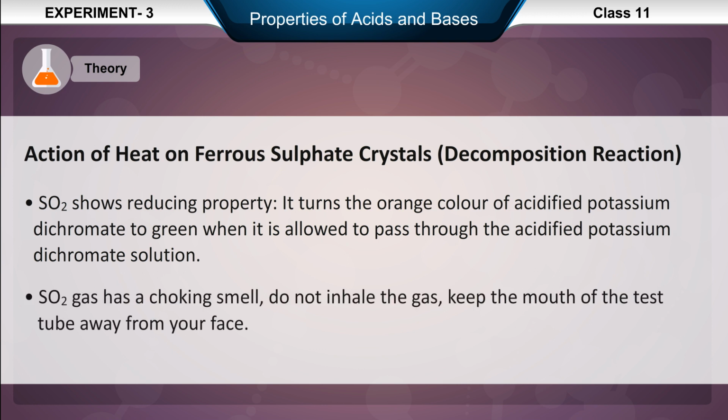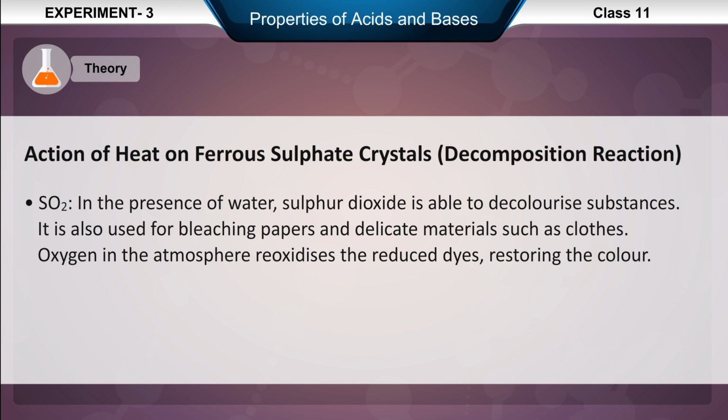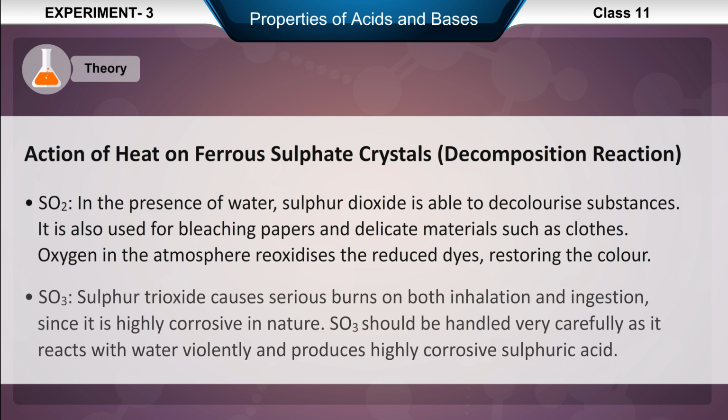SO2 gas has a choking smell. Do not inhale the gas. Keep the mouth of the test tube away from your face. In the presence of water, sulfur dioxide is able to decolorize substances. It is also used for bleaching papers and delicate materials such as clothes. Oxygen in the atmosphere reoxidizes the reduced dyes, restoring the color.